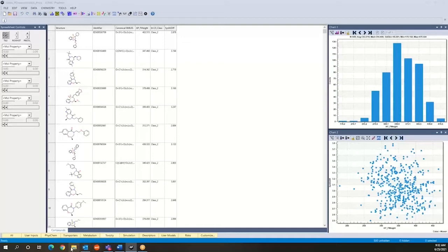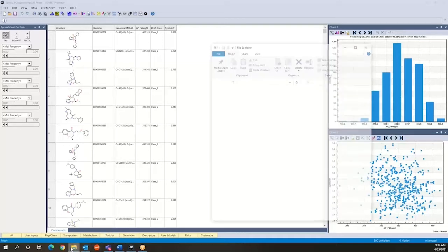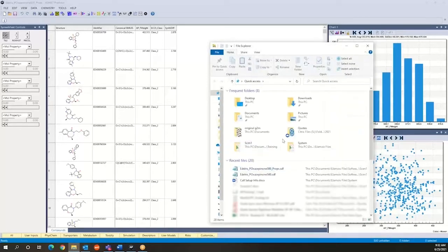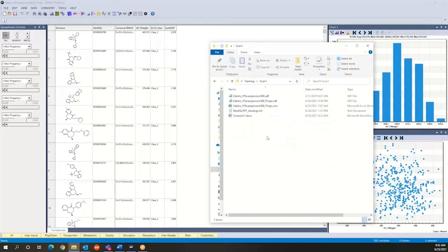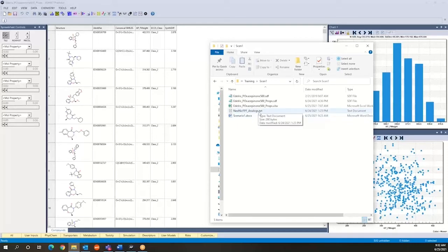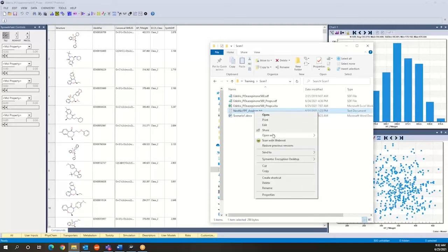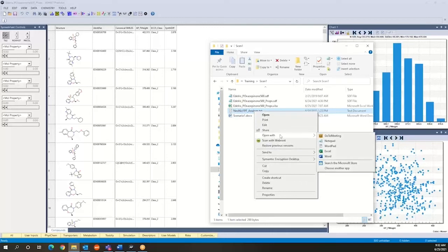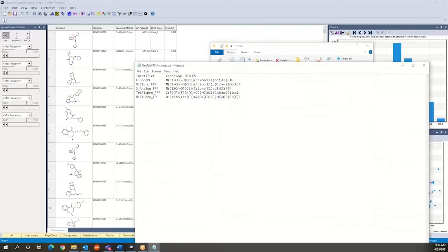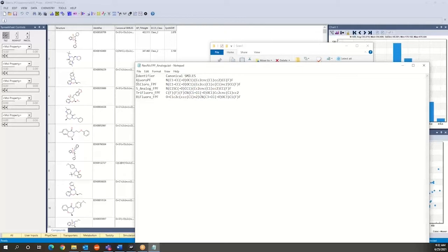So another type of file that you can work with is files containing smile strings. So over here, we're going to open this file also with notepad and you will see that we have a tab delimited file in this case containing the name of the compounds, that's the identifier, and then we have the canonical smiles that define the structure of each one of these compounds.